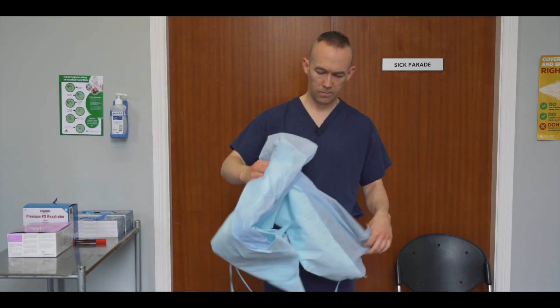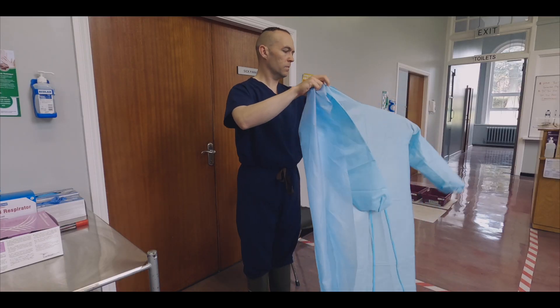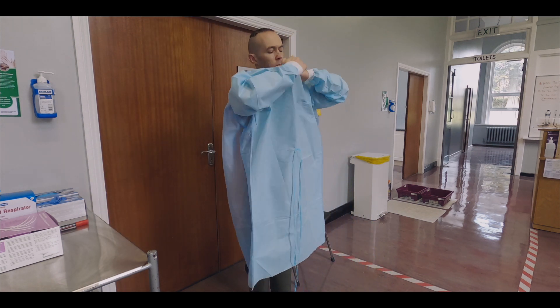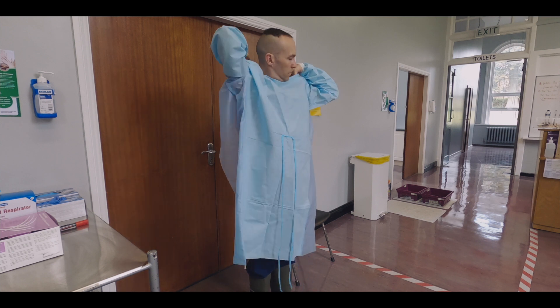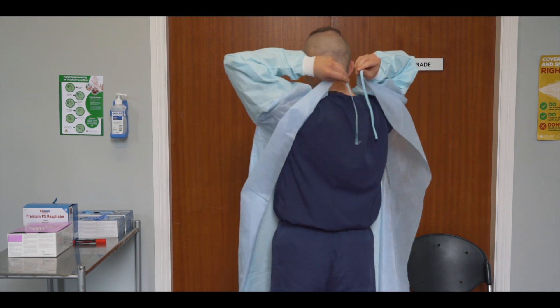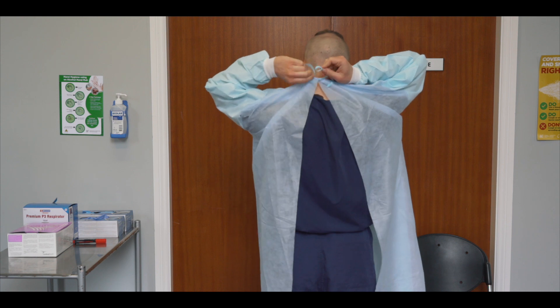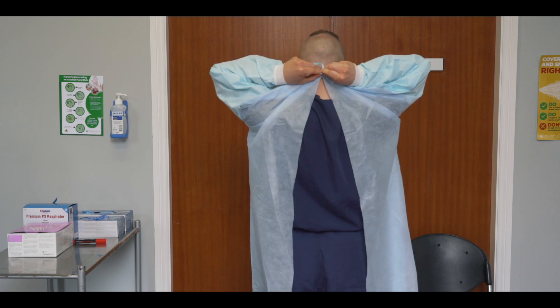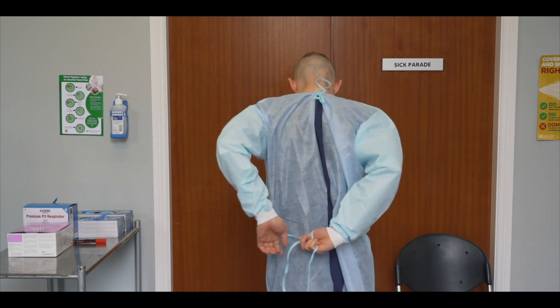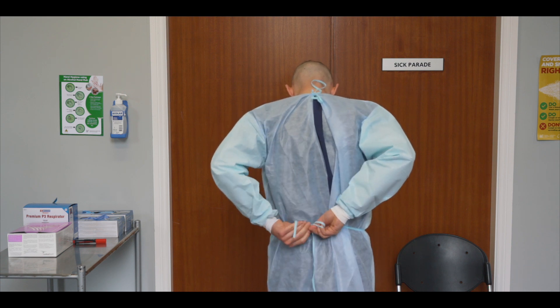Select an appropriate sized apron or gown. Insert your arms into each sleeve and pull the gown up to cover the lower neck area, ensuring that both shoulders are adequately covered. Using the strings or ties, tie the top of the apron at the level of the neck. Seek assistance if required. Tie a knot which can be easily released or torn. Tie the lower part of the apron at the back or side. Do not tie the front of the apron, as the front is likely to be the most contaminated with virus or bacteria.